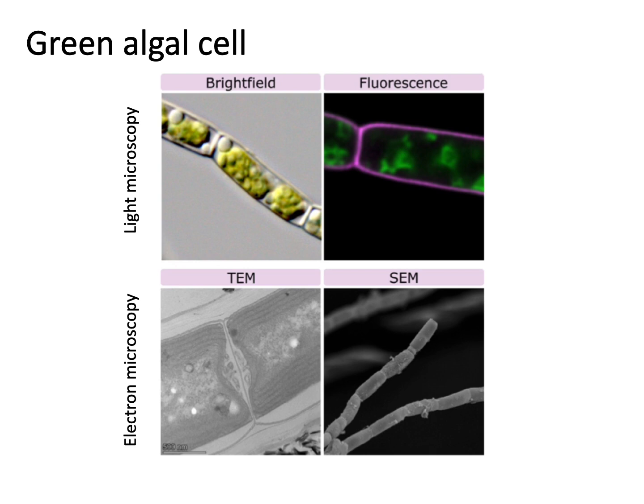Because you'll see on the left, the transmission electron microscopy has some sort of stains that were applied, usually heavy metals, right, that are sticking to some structures. So it looks like they're actually sticking to some of the lamellar membranous structures here. So maybe it's some sort of a lipophilic or a lipid stain. But it's identifying and highlighting some organelles and things that you couldn't see with a light microscope.